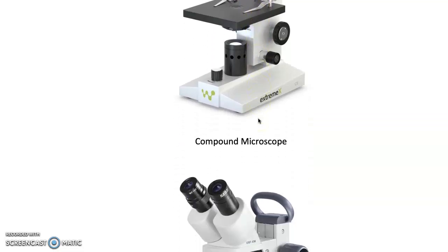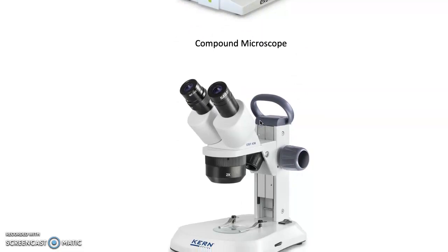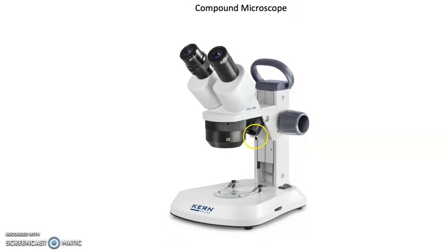The other type of microscope we have, which is for looking at bigger samples such as the Perspex blocks that we have, which are much thicker than prepared slides, is a stereo microscope. You can see here there's a much bigger space for placing your samples. There is still a light source down the bottom, so that's why they're both light microscopes. Again, your eyepieces are magnified by 10.